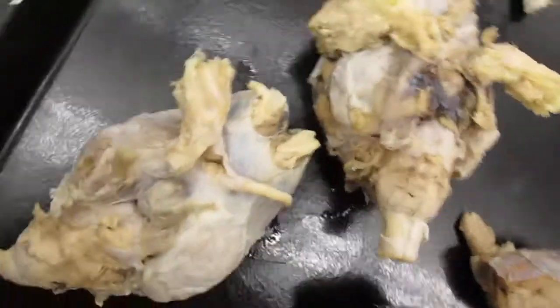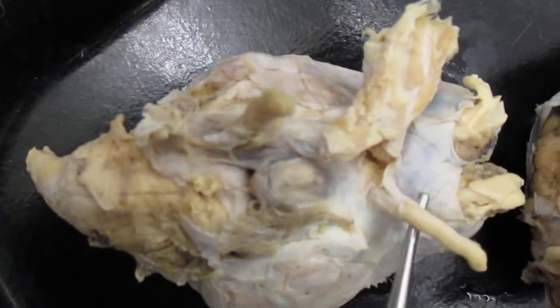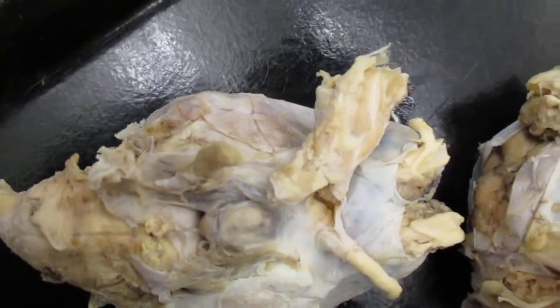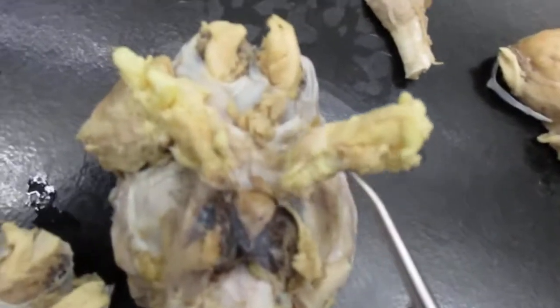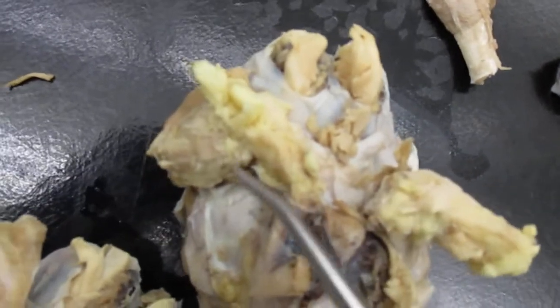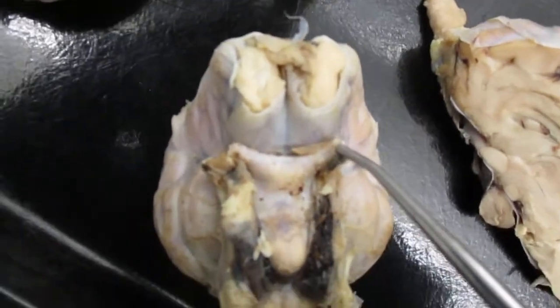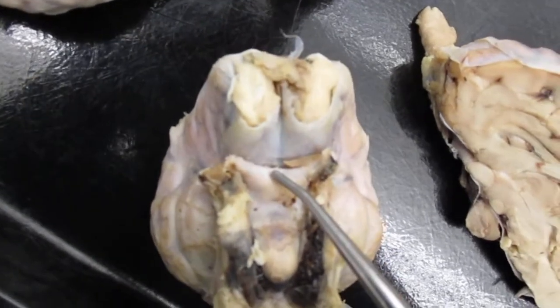And right over here on the sheep brain, we can see the optic nerve, or cranial nerve number 2, right there, and right there. Still got some fat on it. We see the optic nerve here and here. And right here, I've carefully removed all the fat and muscle away, and you can see the optic nerve right here and right there. This place right here is called the optic chiasm.